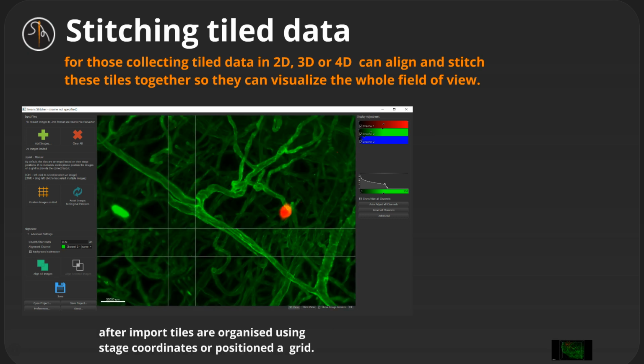So if I zoom in, I'm just going to show you this zoomed up. So here's one of the blood vessels. You can see these overlap regions in this kind of narrow part of the image. And you'll see that the blood vessels are not aligned properly. So this is very common when you do tiling. You'll see that they're not perfectly aligned.